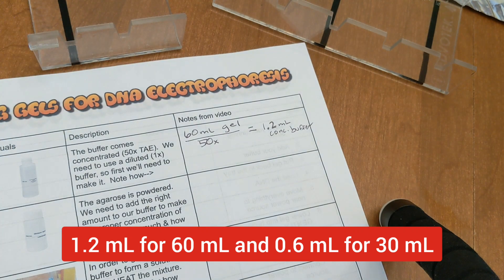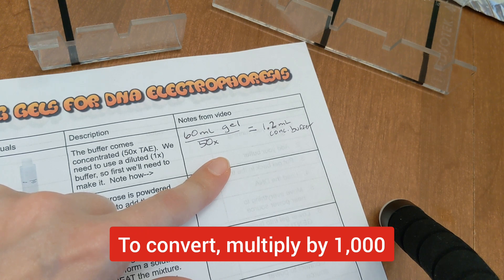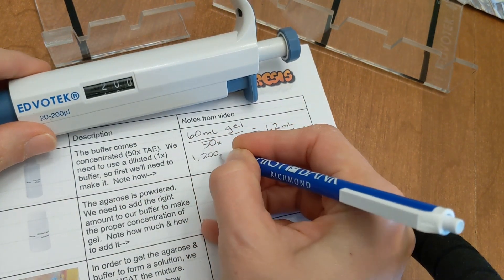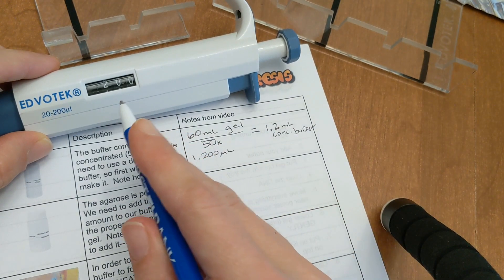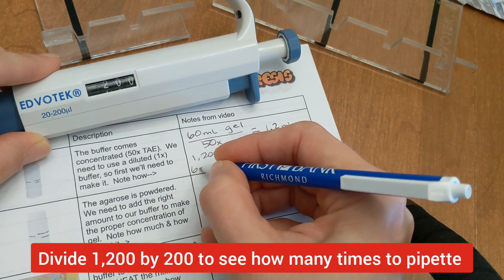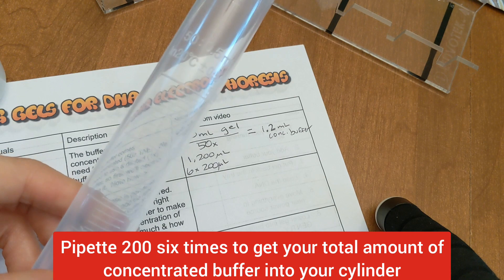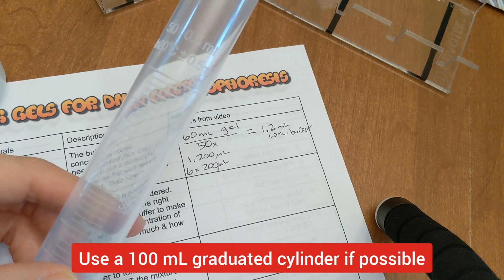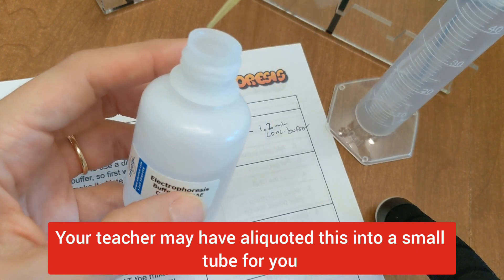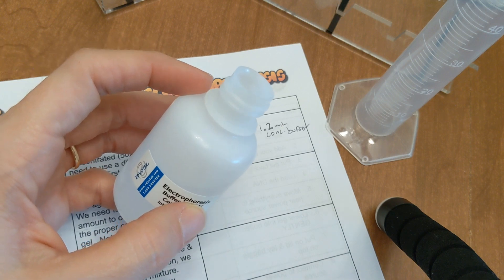First we'll measure out our 1.2 milliliters of concentrated buffer. Since we're using a micropipette, we're going to do this in microliters — 1.2 milliliters multiplied by a thousand gives us 1200 microliters. Since my P200 has a top value of 200, I'm going to have to do this six times, because six times 200 gives me 1200. I'm preparing my buffer in a 50 milliliter graduated cylinder, pipetting 200 microliters directly out of the bottle six times, each time putting it in my graduated cylinder.